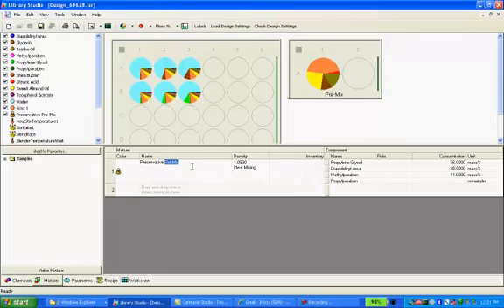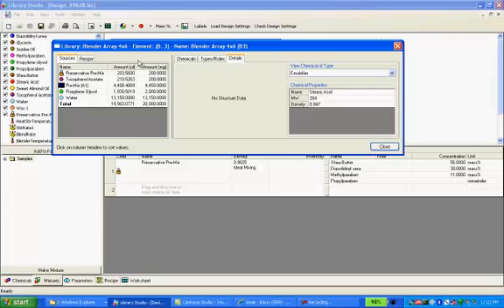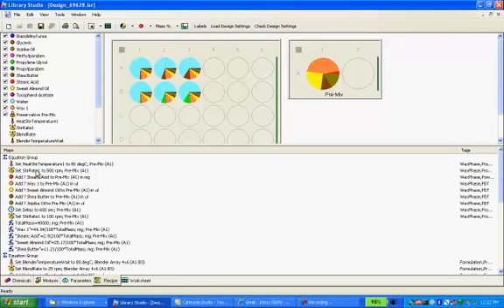It just creates a number of... I'm going to click on this and look at some other options. Click on this and see the composition and the sources, the types and roles. Close right here. Then I'm going to click on recipe. Here's what I see, the recipe.